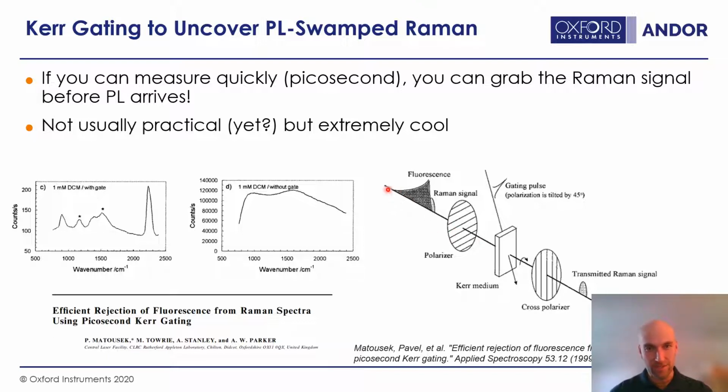So here's the fluorescence, and then this is kind of time, right? So there's time in this direction. So our Raman signal is coming right before that, promptly before the fluorescence, and I imagine very vividly, kind of like, what's his name, Indiana Jones running away from the front of the boulder. So the Raman is just booking it as quickly as possible, ahead of the fluorescence. So if you can snip this time point off right here, you can actually capture the Raman very quickly.